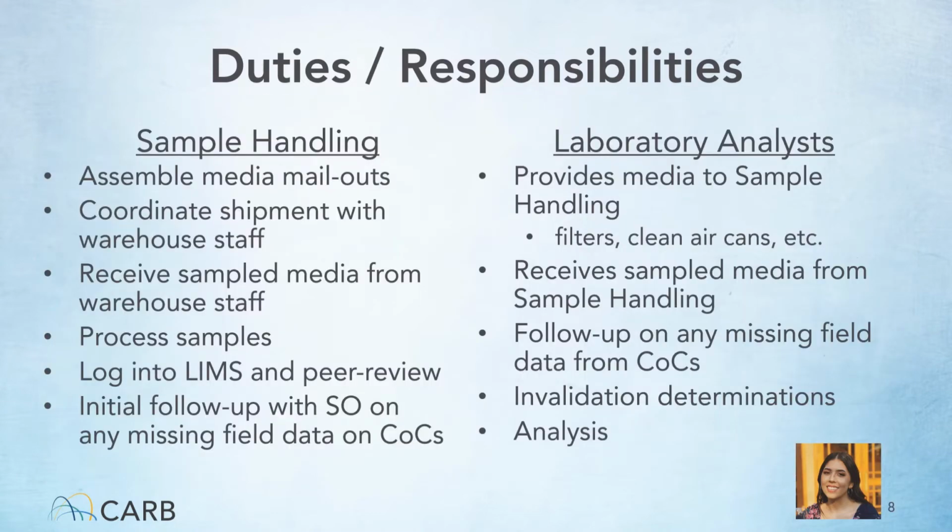Sample handling works closely with the laboratory analysts and MLD's warehouse staff to get media out to the field and back to the analysts for eventual analysis. Here I'll briefly describe the interactions and highlight the different roles.